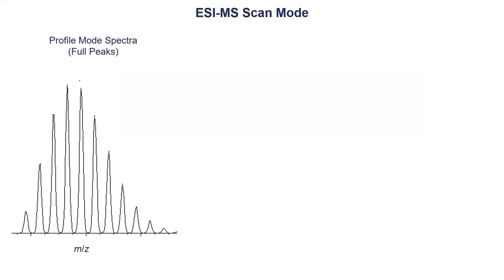So coming to the mass spectrometer now. We spoke about the separation technique, and very briefly about the ionization. And then if we think about the MS, what do we get? What we always need to know is that the mass spectrometer normally acquires the data in profile mode, which you can see on the left side, which has a lot of data points. Every mass has multiple data points based on the distribution.